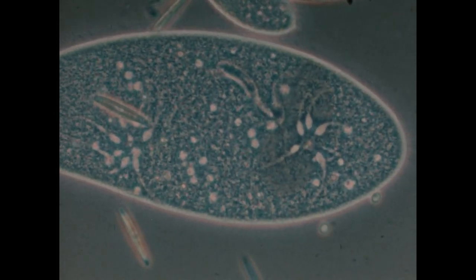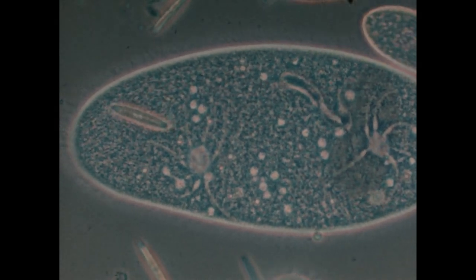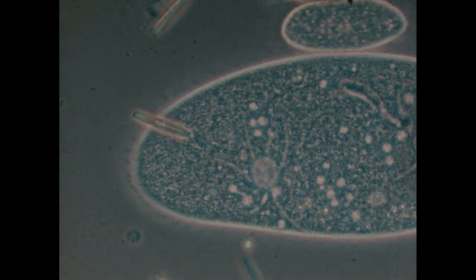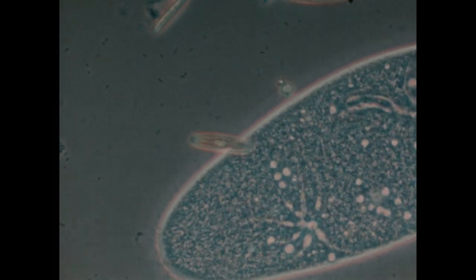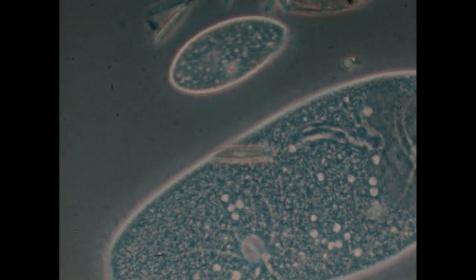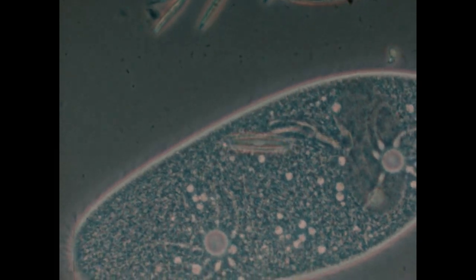In phase contrast lighting, clear structures stand out without sacrificing resolution. This kind of revealing image, showing living processes in action, is what makes phase contrast such a valuable imaging tool.